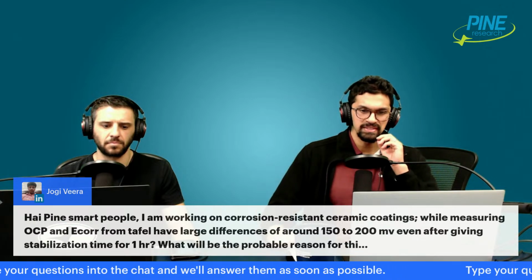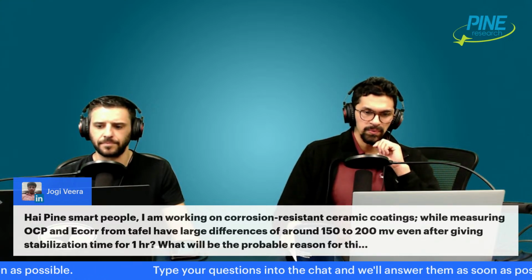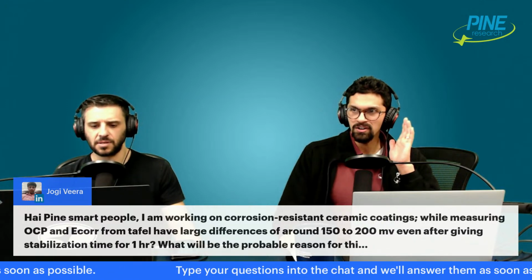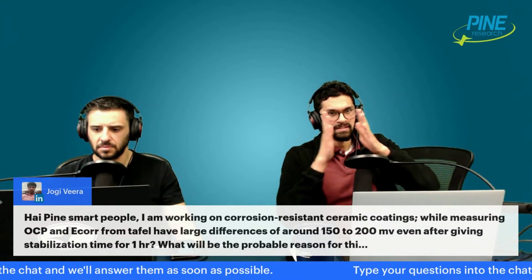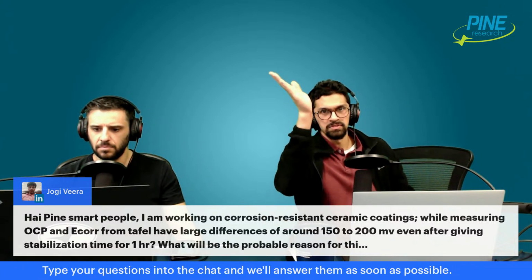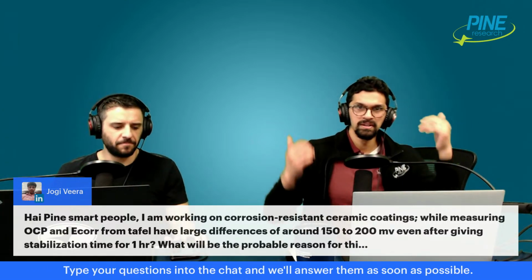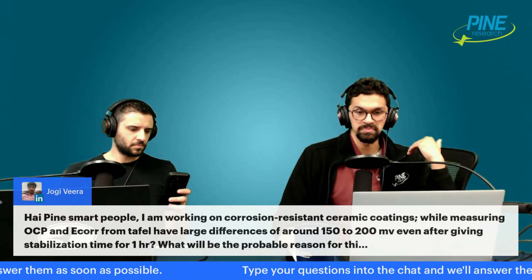I'm trying to think, if you're doing a Tafel analysis on a corrosion resistant ceramic, what would be the necessary electrochemical procedure? I think you still do a slow CV, an LPR slow scan experiment away from OCP. Maybe OCP is stable, and then when you're doing your very slow scan, you're getting some currents. You're able to create one of the Tafel slopes, and then do it the other direction, you get the other Tafel slope. And where those two Tafel slopes intersect may not be where the open circuit potential is.